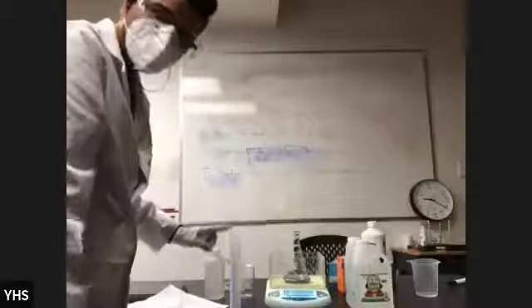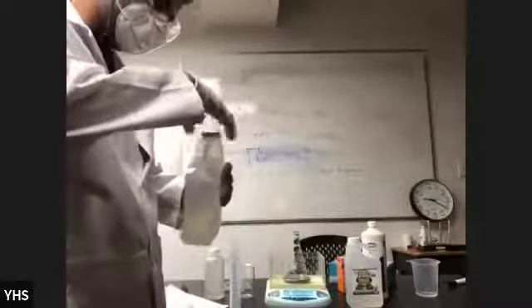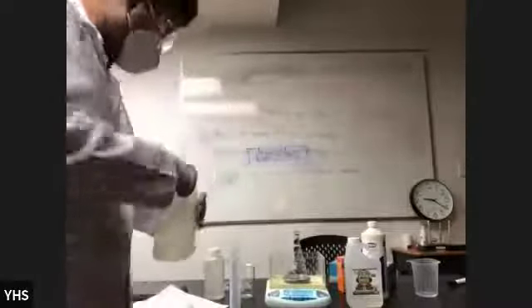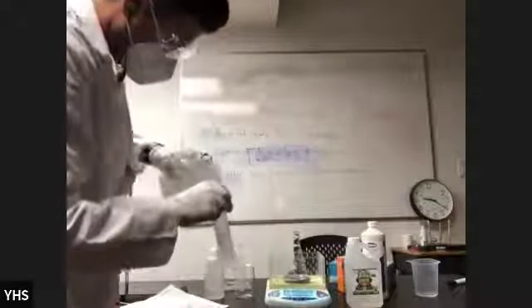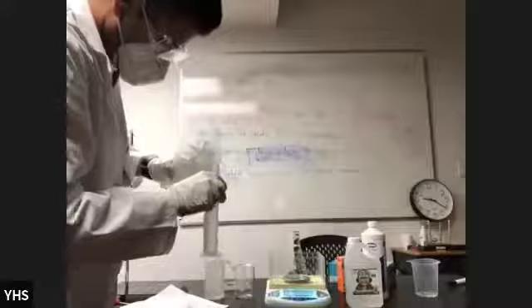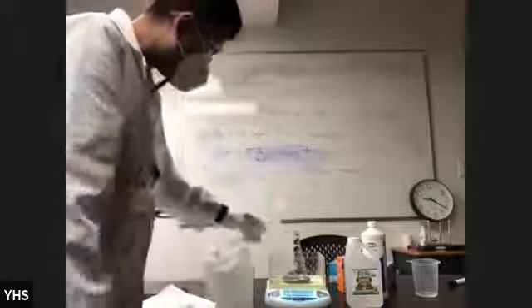Here, let me pour some vinegar in it. 150 milliliters. I'll just add this here.